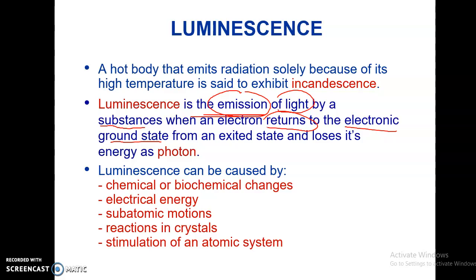Based on the Jablonski diagram, there is a certain level, whether it's a singlet state or triplet state. All this depends on the molecules that are bombarded with the radiation.